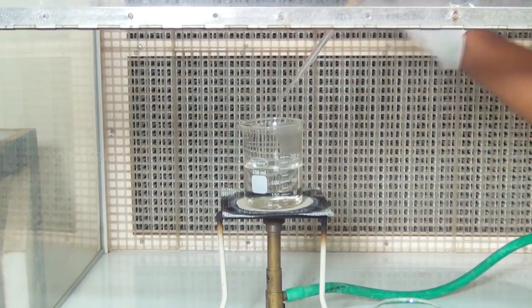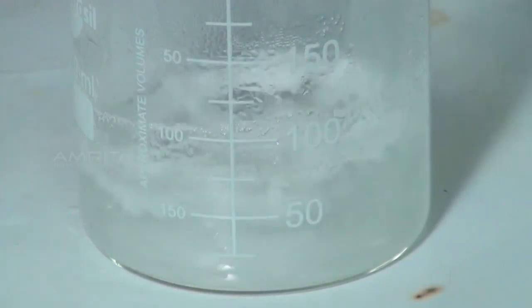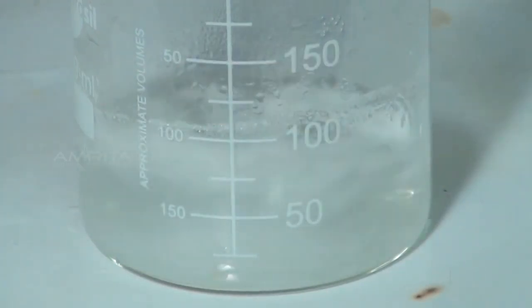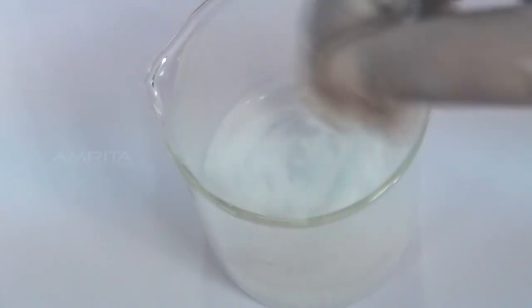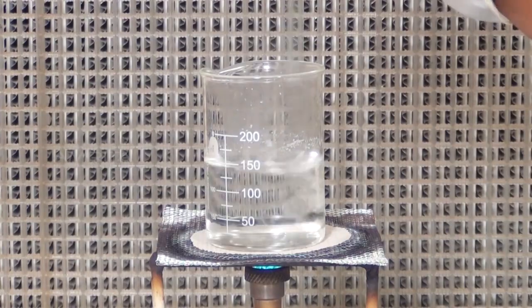Using a dropper, gradually add a minimum quantity of boiling water, just sufficient to dissolve the benzoic acid. Stir using the glass rod. If required, heating can be done to dissolve the benzoic acid.